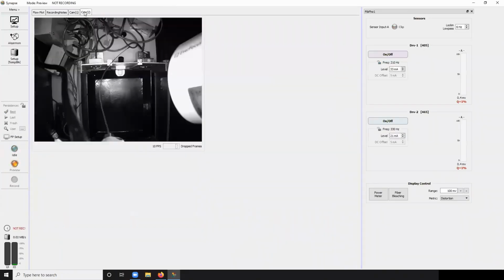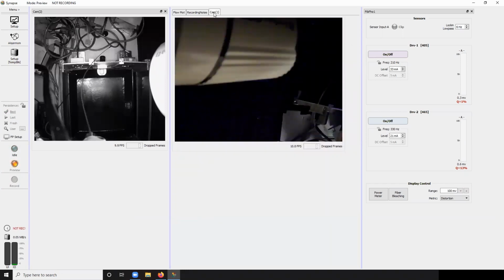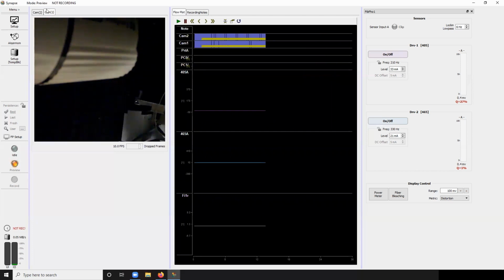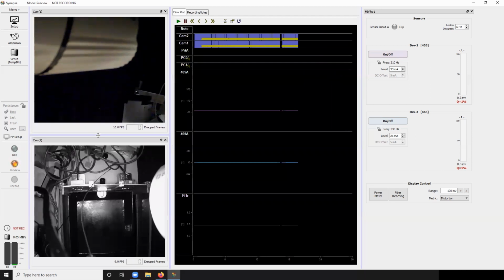So here's our cam. Split that over to the left, maybe. So, okay, it's going to hover around 10. Doing a pretty good job. Cam 1. All right, here's our cam 1. We can drag that over here. Right click, split up. We got our 2 cameras over here. That's wonderful. If it ever drops frames, it'll tell you here.